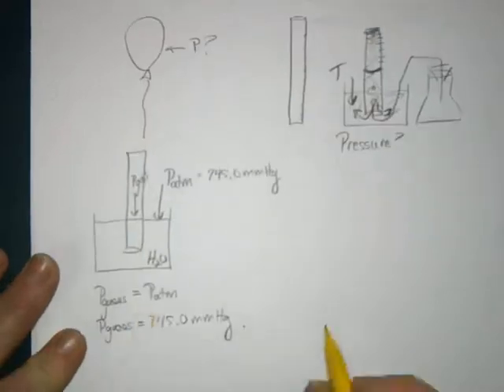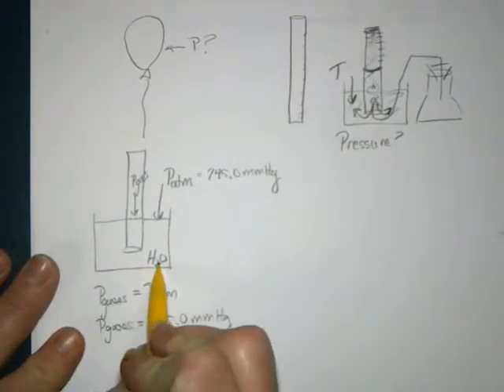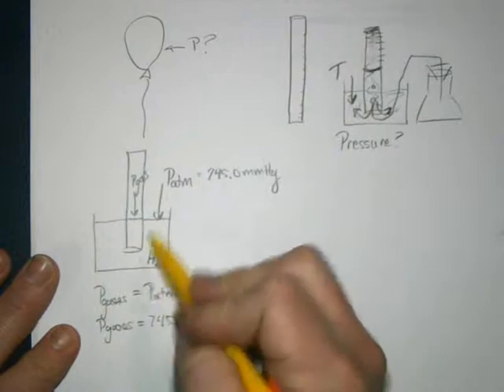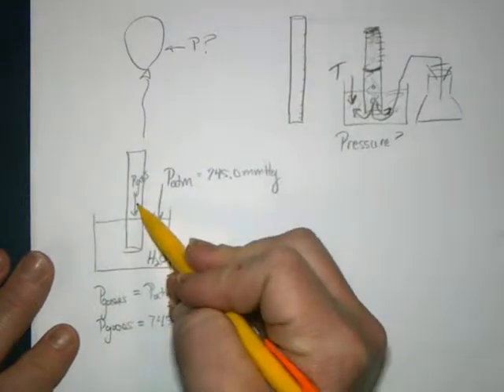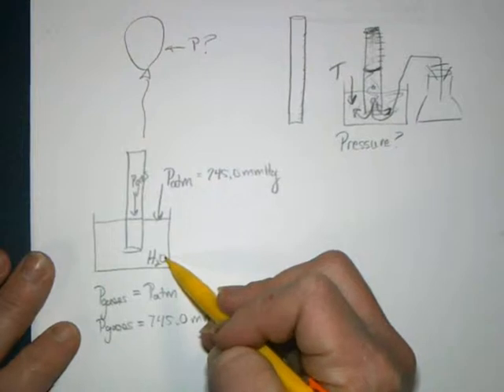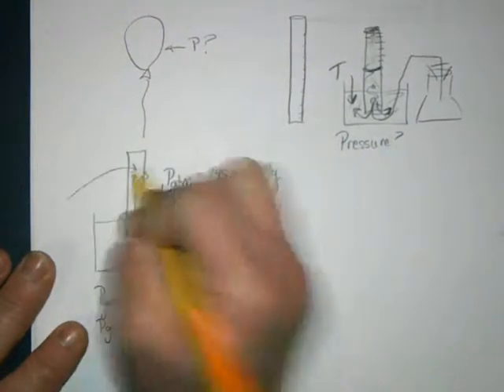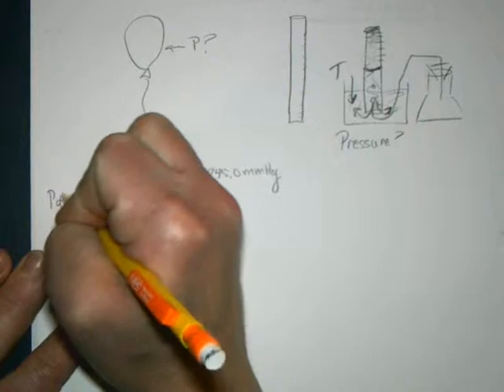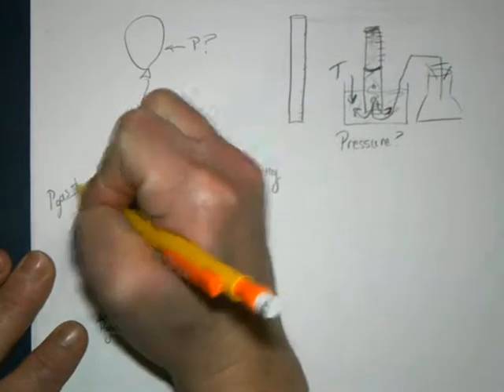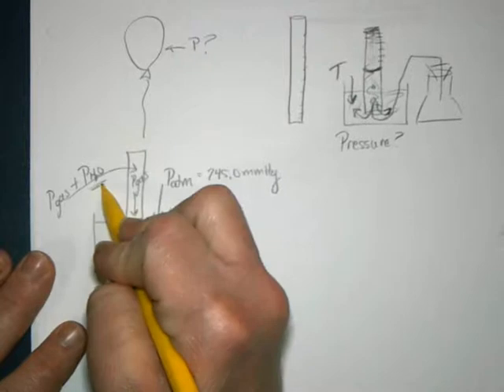Why do I write gases? Well, whenever we have liquid water, we also have water vapor. So whatever gas we were trying to collect purely, because water is just nice and safe and accessible to use, well, we're not only going to have the pressure of the pure gas, but also the pressure will be due to the presence of water.